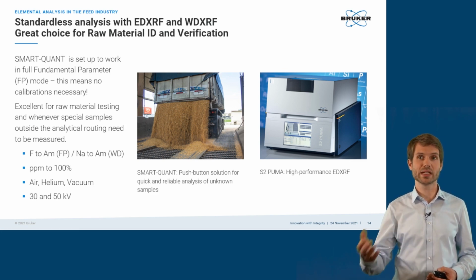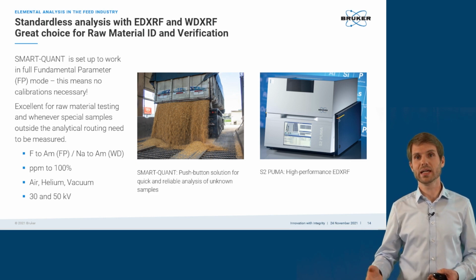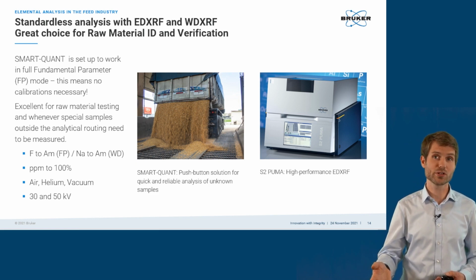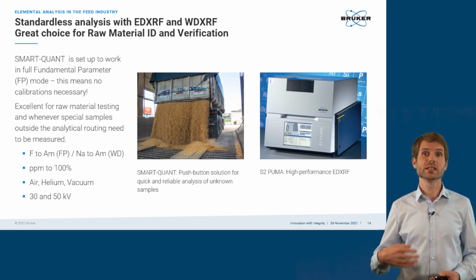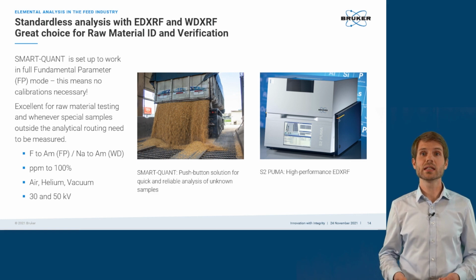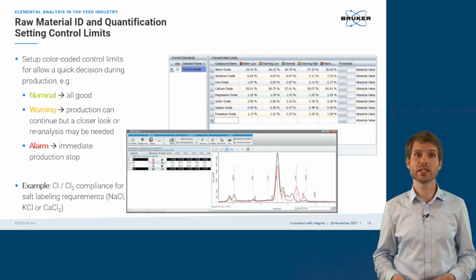Basically, you would say it's a powder, and you might put in that it's a mineral phase, or that it has a certain matrix, but not even that is needed, depending on how much you want to get from this information. And then you can easily get the information what kind of material you're dealing with.